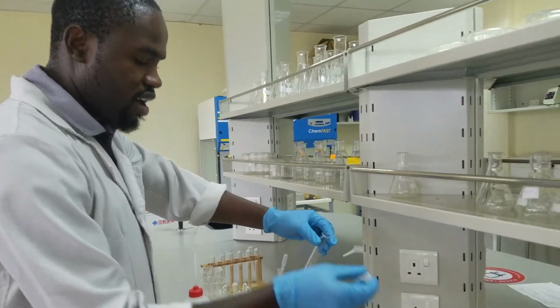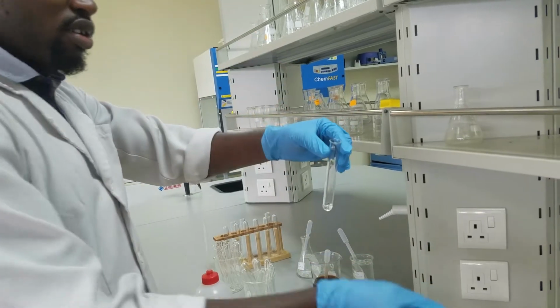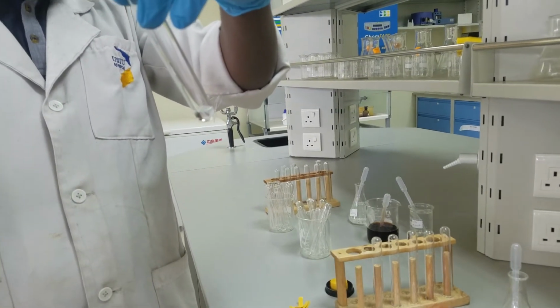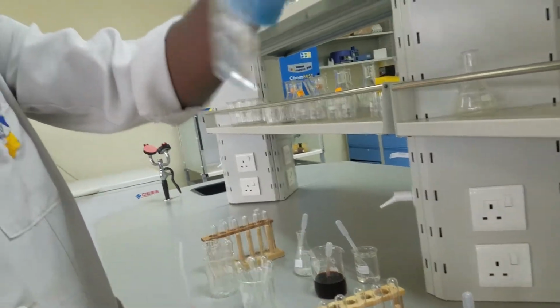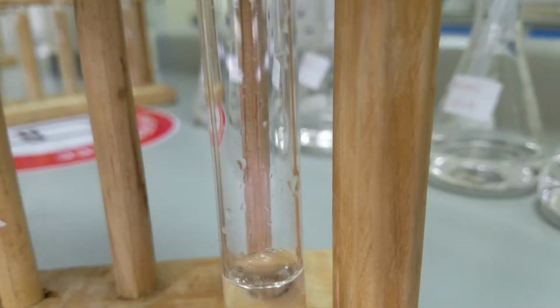So I'll take a few drops of formaldehyde, add water, distilled water, like that. Now observe from there.